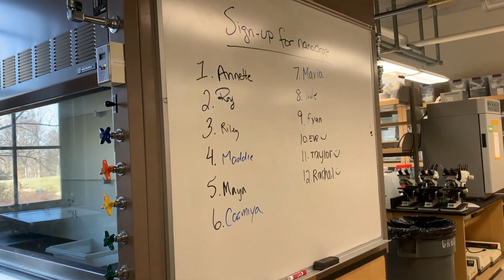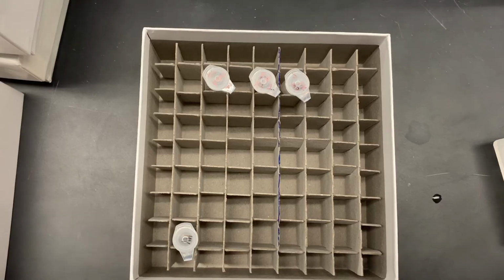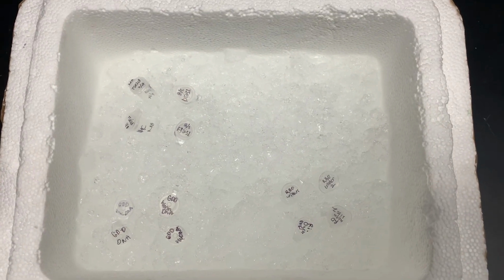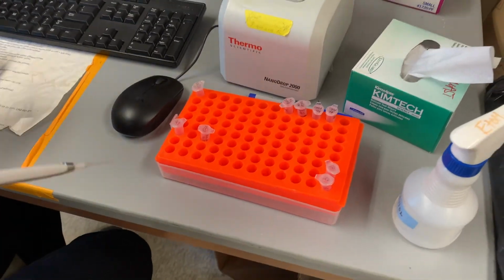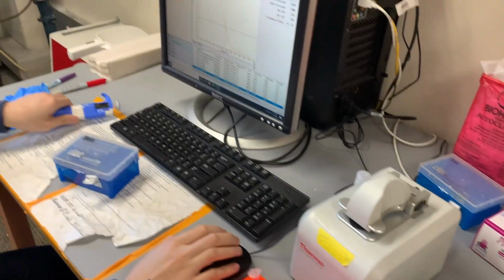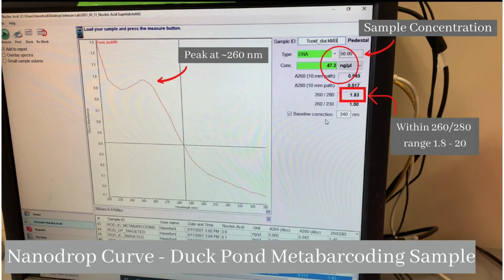The Nanodrop is like a small spectrophotometer where instead of a glass tube, the solution itself is going to be pipetted with 2 microliters onto the reader, where the drop is held together through capillary action. Based on the reading, we'll be able to determine the concentration of DNA, and based on the quality of light, understand the quality of DNA. The results will yield a curve, and if there's a peak around 260 nanometers, we'll be able to conclude that there is DNA present in our sample.